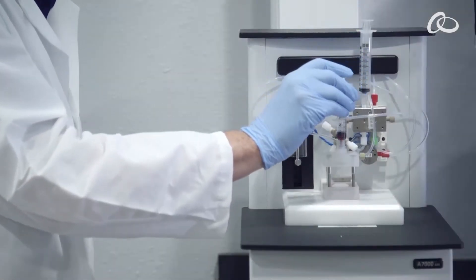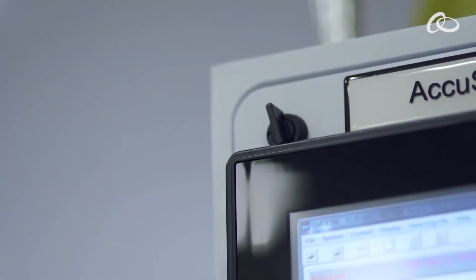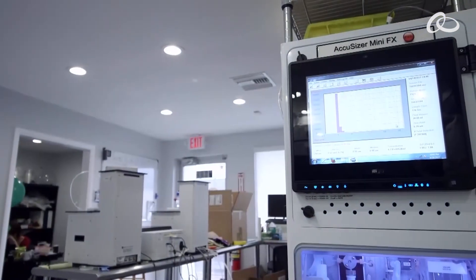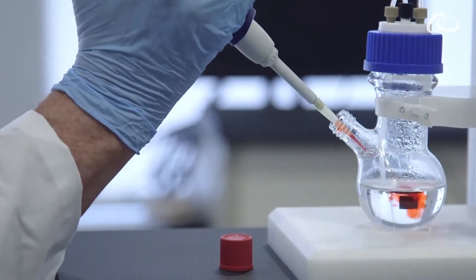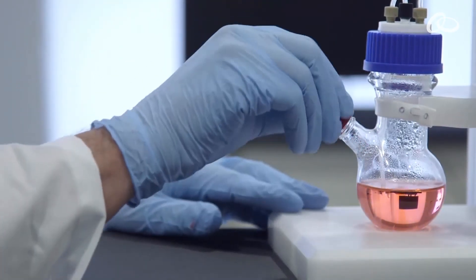The AccuSizer is used to count contamination particles in liquids ranging from parenteral drugs to water and hydraulic fluids. It's the industry standard for detecting large particle counts in CMP slurries and is used as a particle size analyzer in the pharmaceutical, ink, and emulsion industries.